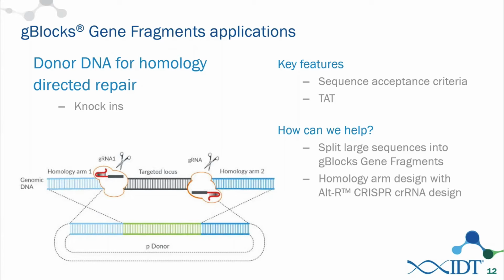And if you put a sequence of DNA that is desired between those homology arms, this insertion reaction will insert that targeted locus in the place of the double-stranded break. That targeted locus could be as small as a SNP, maybe that changes the existing SNP into a different sequence. It could also be something larger, something that could encode an entire gene or even a cassette that may contain something like an antibiotic resistance or a GFP marker or a wide variety of different things.